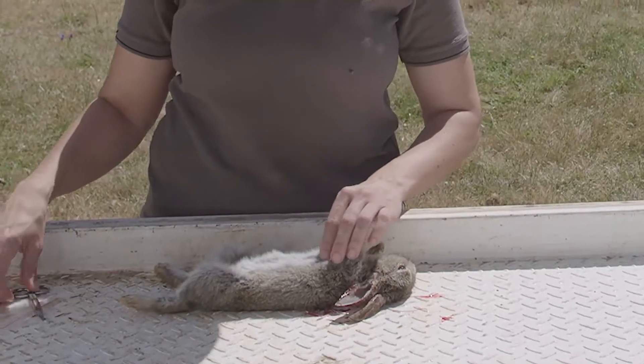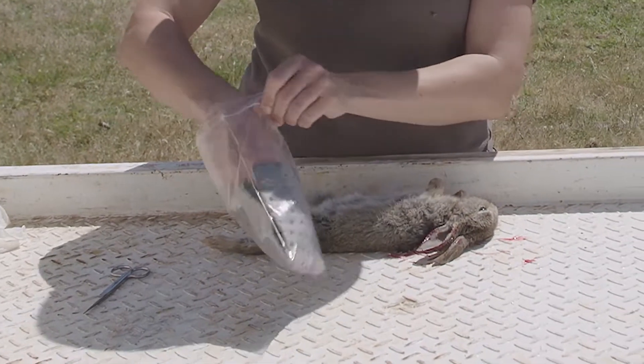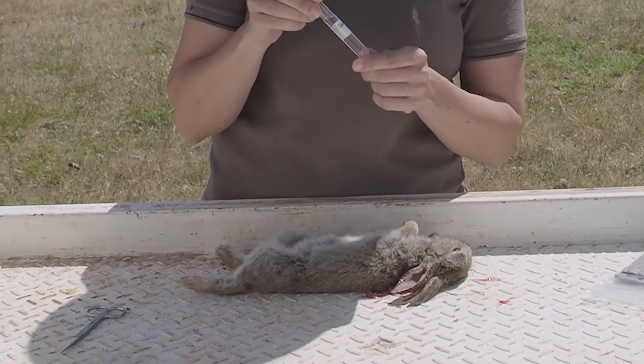So now I'm just going to take a sample of the rabbit to get it tested for RHD. In the sampling kit there's a small vial with some preservative liquid in it that the liver or the leg bone needs to go into.